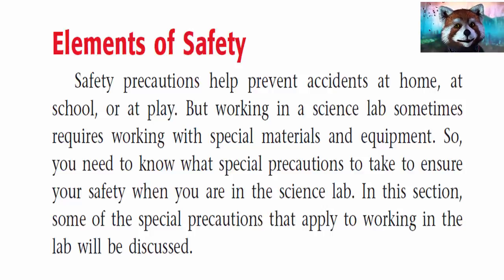Elements of safety. Safety precautions help prevent accidents at home, at school, or at play. But working in a science lab sometimes requires working with special materials and equipment. So you need to know what special precautions to take to ensure your safety when you are in the science lab. In this section, some of the special precautions that apply to working in the lab will be discussed.